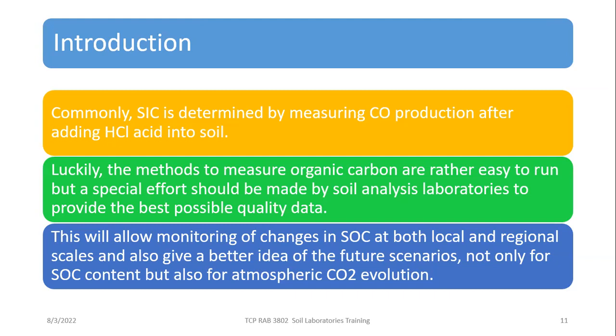Actually, you did it in your practice. When you want to measure calcium carbonate by calcimeter, you add HCl, so the loss in weight will give you the percent of calcium carbonate. This loss in weight is not an indication only of calcium carbonate; instead, it is also an indication of soil inorganic carbon.